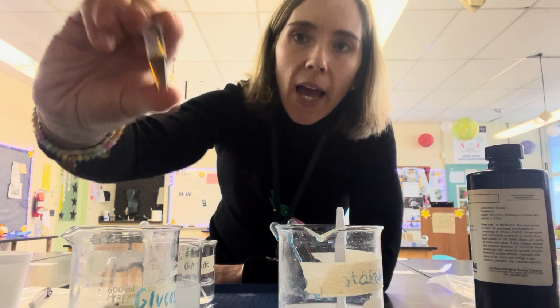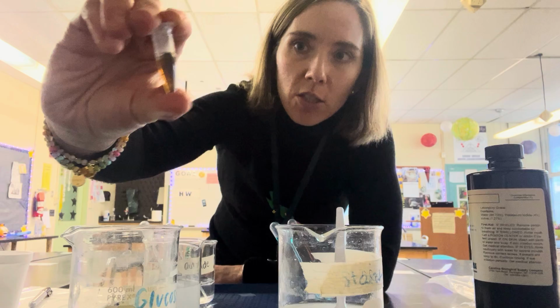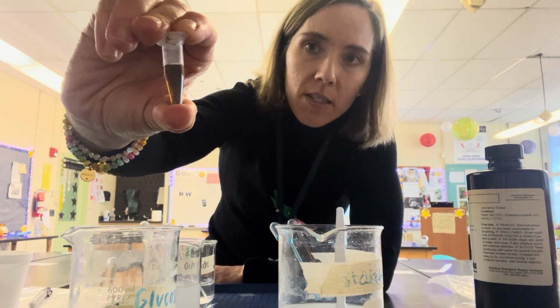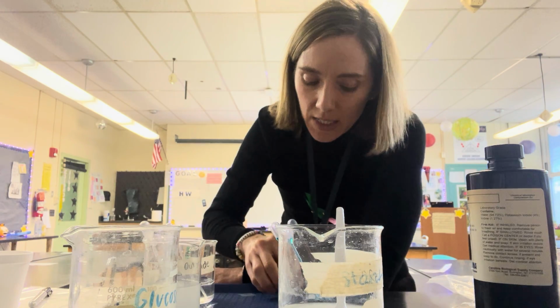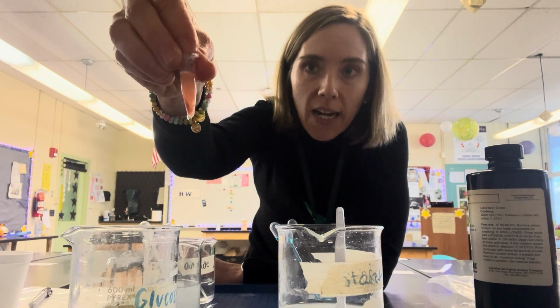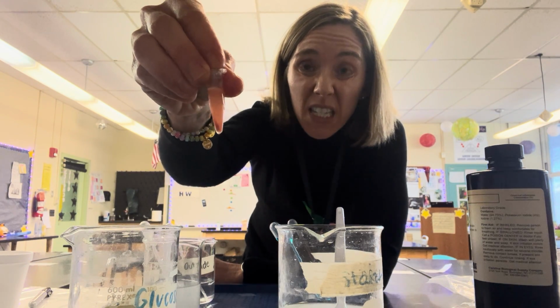So my inside is pretty much a change for my iodine, saying that there is starch inside the tube. Let's see if anything happened with glucose. So my inside Benedict's also reacted. So it tells me that there is glucose inside the tube.